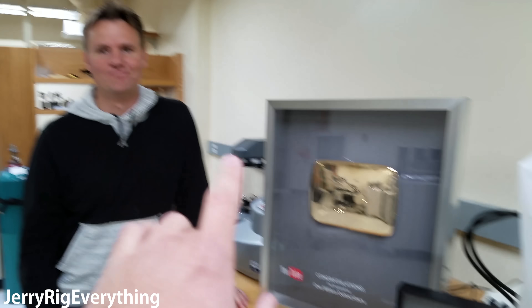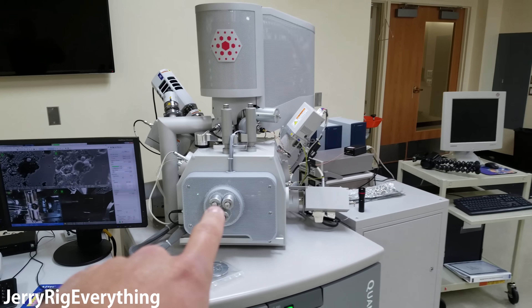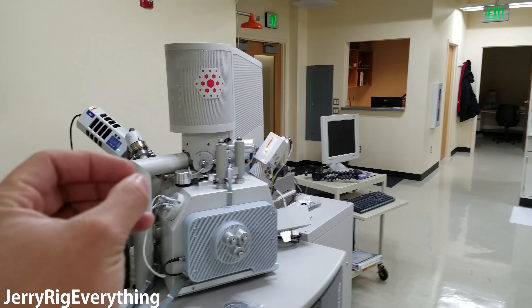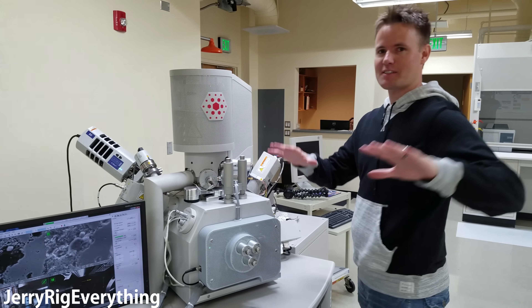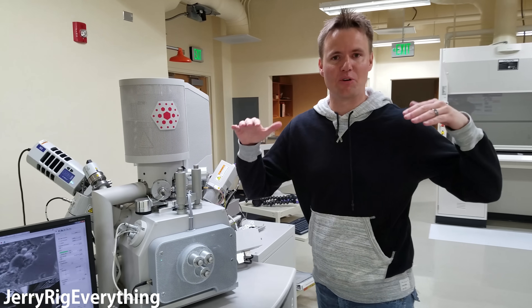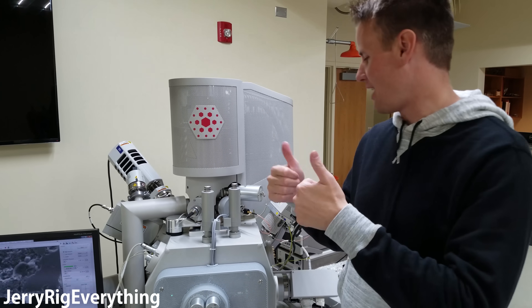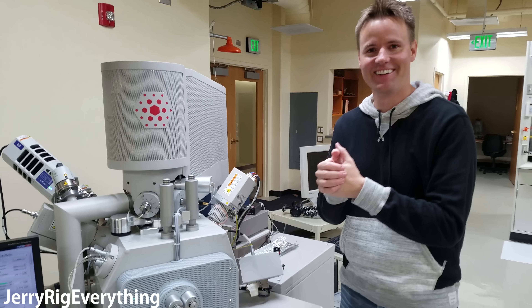Well, I know one place that this button has not been, and that's inside of this electron microscope. What do you say we toss it in here and see what it's actually made of? It's funny because my thing's been cut in half, but as long as it doesn't turn it purple or blue or something, I'm good. I can't promise anything, but let's do it.